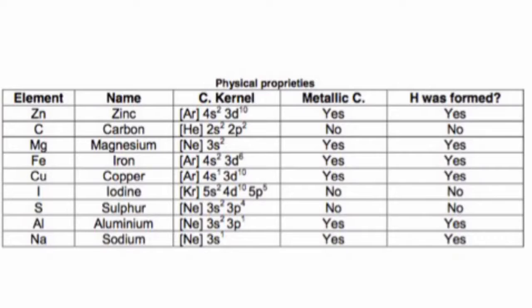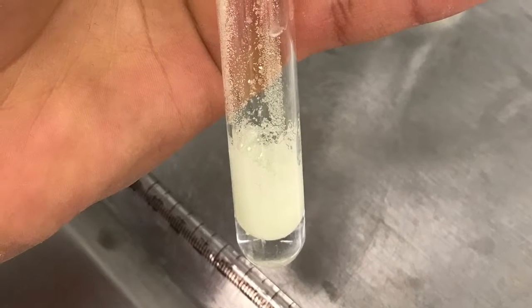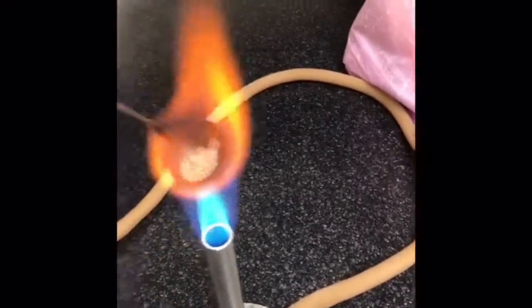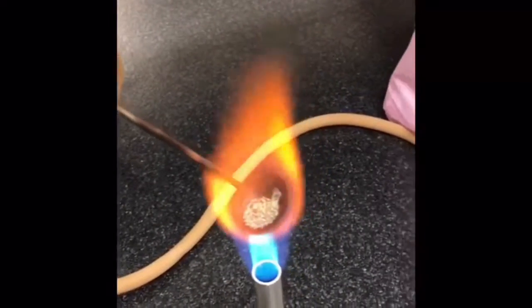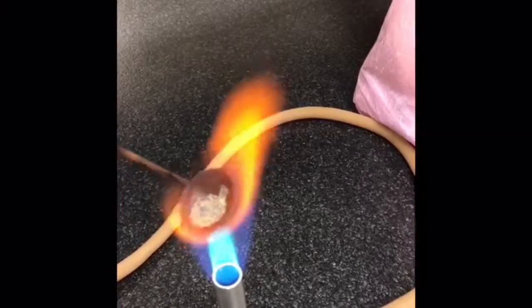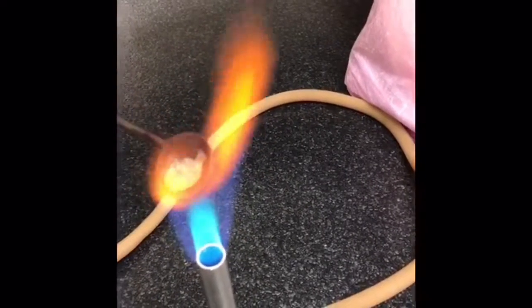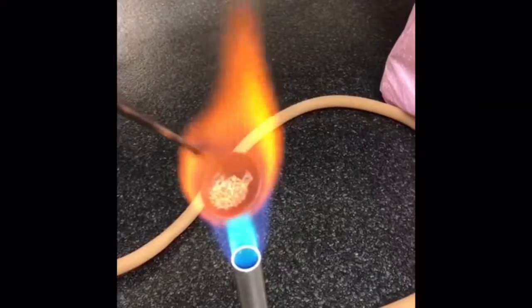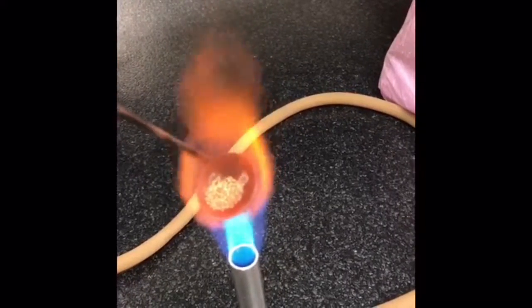In conclusion, the practice was a little bit long and we had to divide the work. We dealt a lot with the test tubes and with the material. When we used the rapid oxidation on the zinc, we noted that it didn't burn, but it did change in some characteristics, like it changed its shining characteristic and it became a darker color.